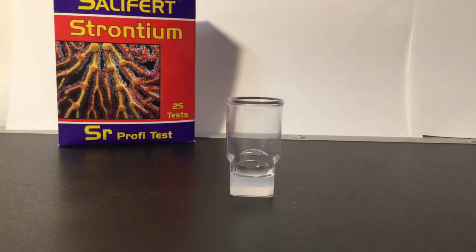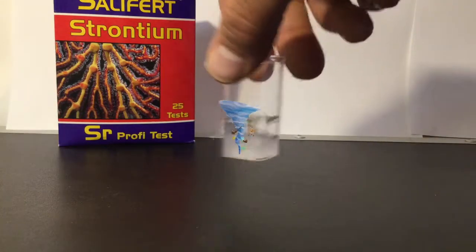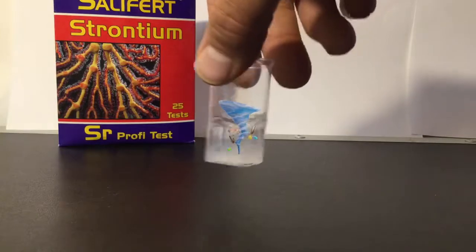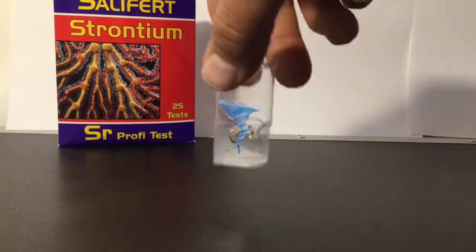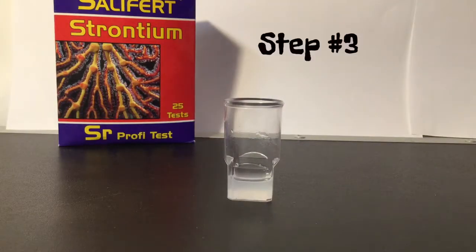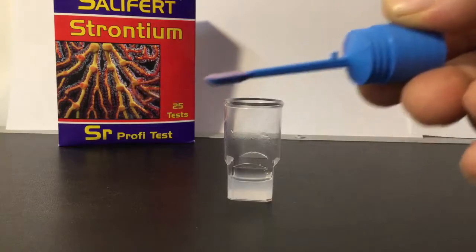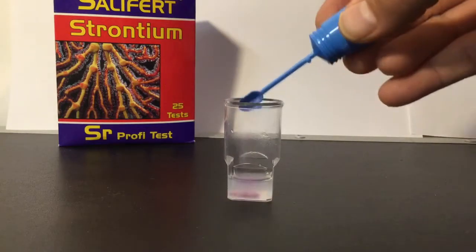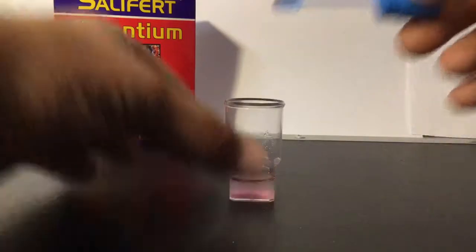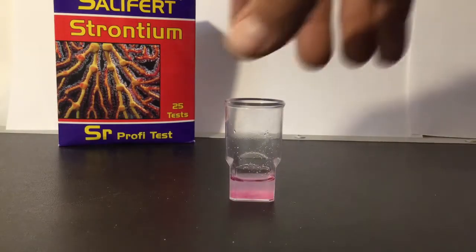See that? That's what I'm talking about with the double drops. Now you have to swirl gently for 10 seconds. After swirling, you need one level spoon of SR2 — just one level spoon — put that right inside the test vial, and then swirl gently for five seconds.